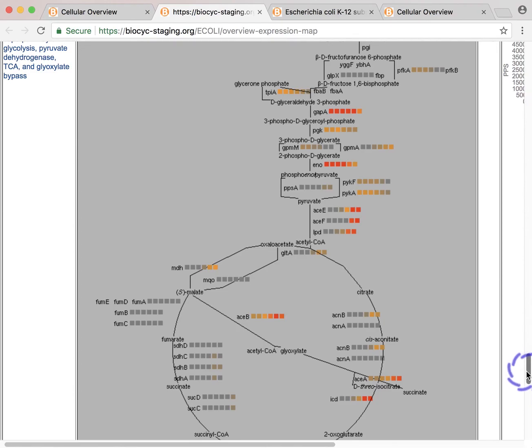That concludes this introduction to the Omics overlay in BioCyc. As you may have noticed, there are several other ways to load data and display it that we didn't cover in detail. These other options are documented either with the info buttons in the dialogues or in the online BioCyc manual, but they all work with the visualization tools I've demonstrated.